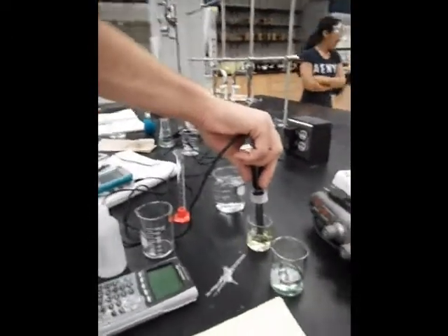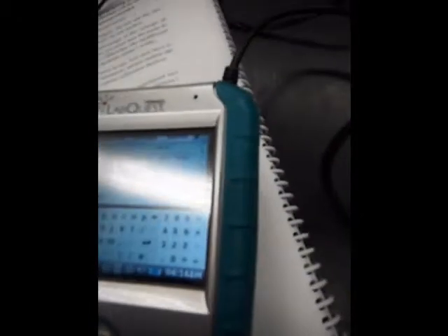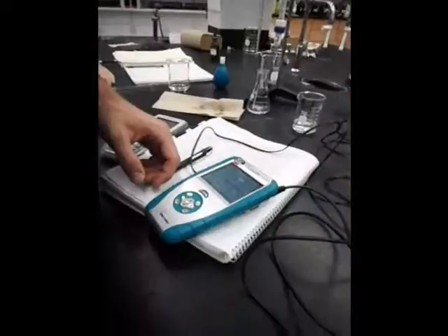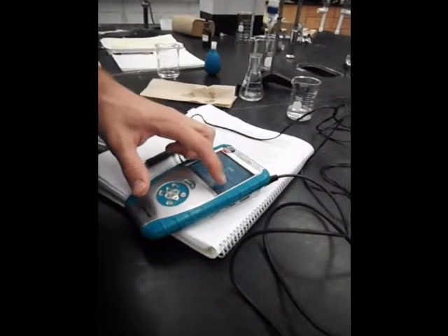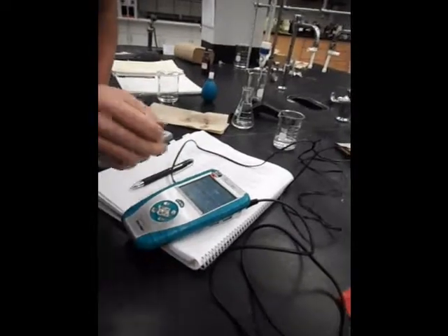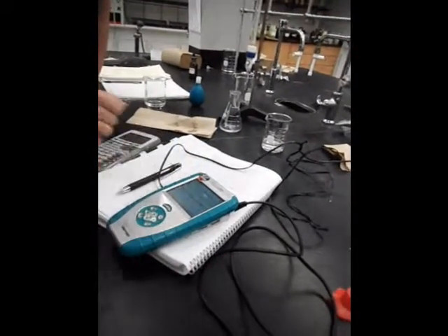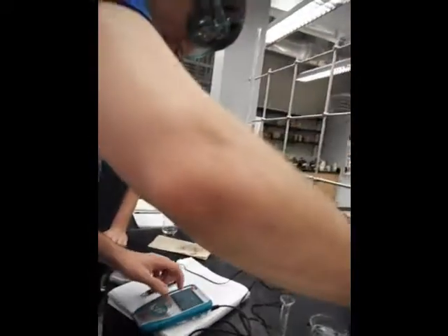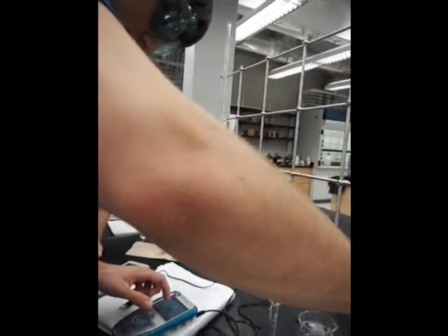After this, the calibrator will be placed in a solution with a pH of 4 because we are measuring the pH values of acidic solutions. The same process should be used to calibrate it at the 4.